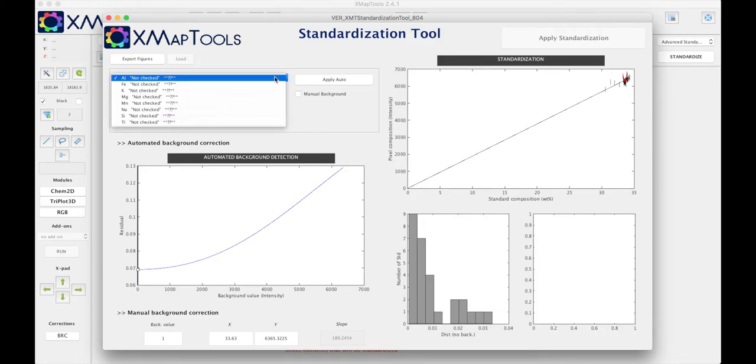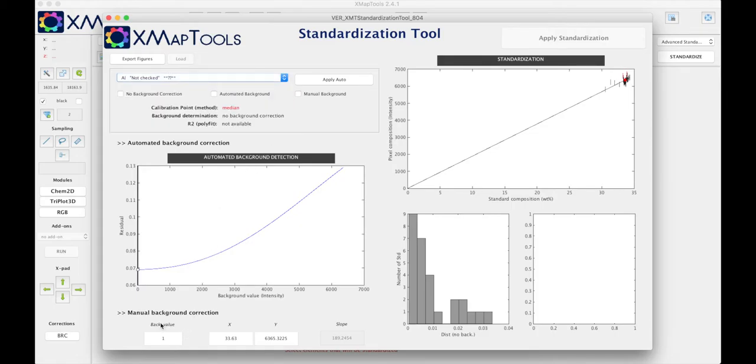In the menu you can see all the elements to be calibrated and we need to go through all of them one by one and define the calibration curve. To define the calibration curve we use the value of the intercept and the x and y coordinates of the calibration points, here in red in this diagram.